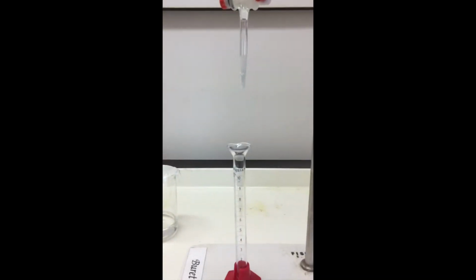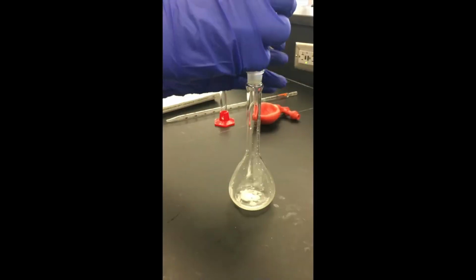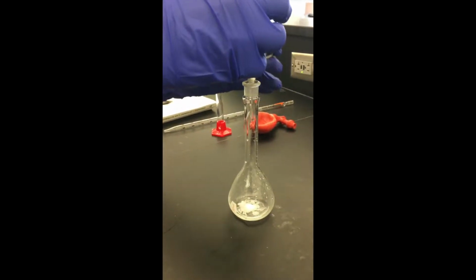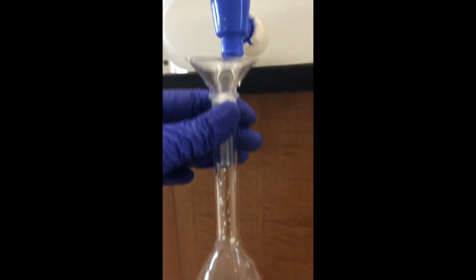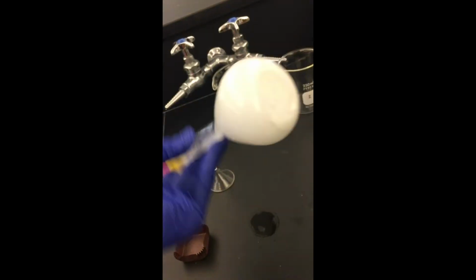To make your unknown solution, first get 3.8 milliliters of 12 molar HCl. You're going to empty about 3.8 milliliters into your 10 ml graduated cylinder. Weigh out 1.5 to 1.8 grams of your unknown. Transfer your sample to a 100 ml volumetric flask. Fill your flask to the line with DI water. Invert your volumetric flask to get everything in solution.